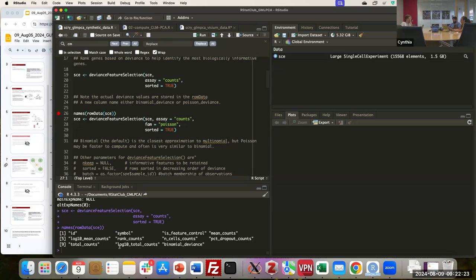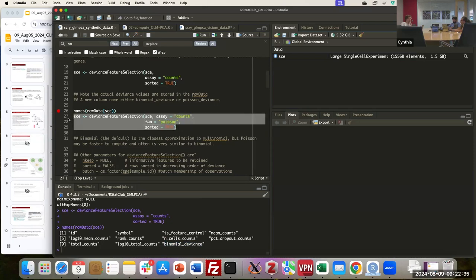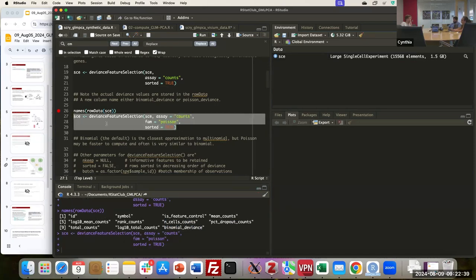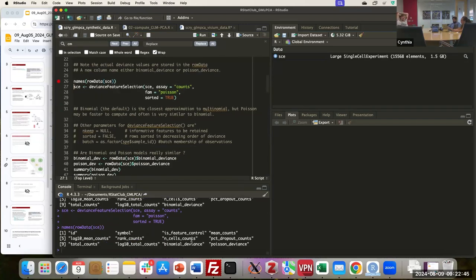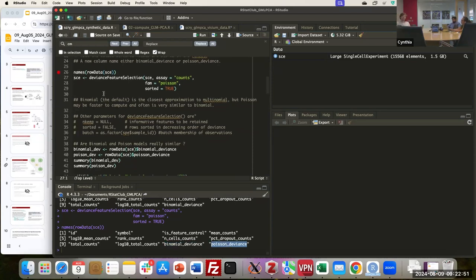We can see that this is running fast. The deviance values are sorted in the row data and added as a new column called either binomial deviance or Poisson deviance, because we have two models available. We can see in the metadata that we now have an additional column called binomial deviance. We're also going to add the Poisson deviance to have both models in the same dataset and compare them.